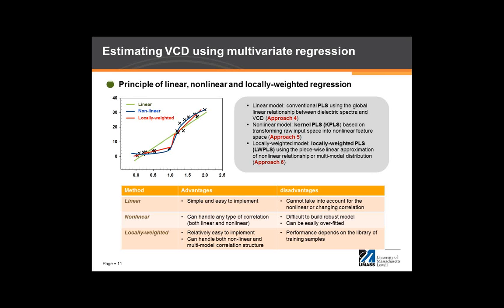So with a linear system technology, we can see immediately that this may not work well covering the whole cell growth curve. We may need two different partial least squares regression models, one during the exponential growth period and one during the declining period.